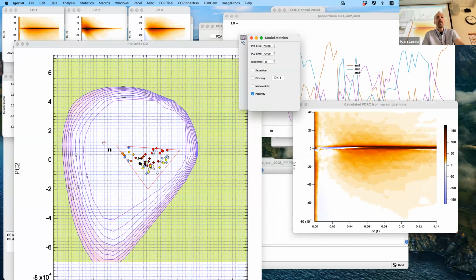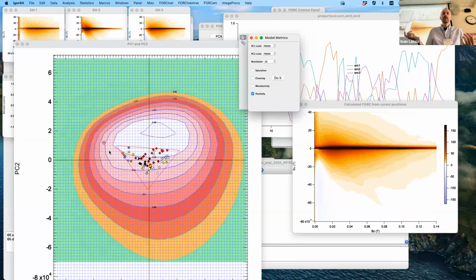But as a rule of thumb, I try not to go too far away from the data. As you've seen, the data organized itself in a way that you can pick out that triangle. You can play with it so that there's not so much white space here. It's sort of subjective, the way you choose the end members, but that's one of the shortcomings.